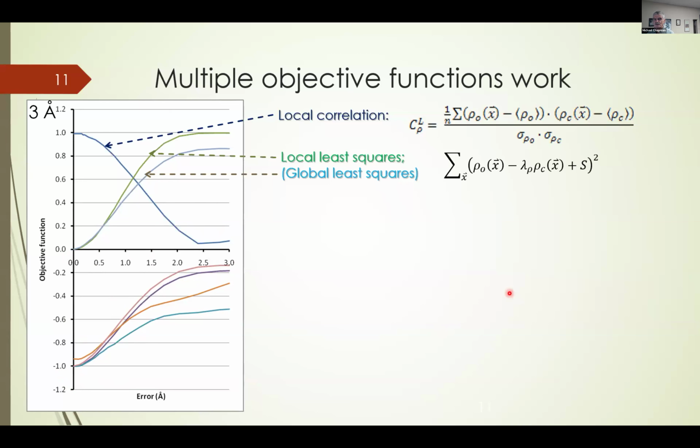So let's look at some approximations now. In this first one, you can see that this is very close to being a correlation coefficient, providing that we normalize our maps, that we have each of them with a mean value of 0, so that we get rid of this term here and this term here.